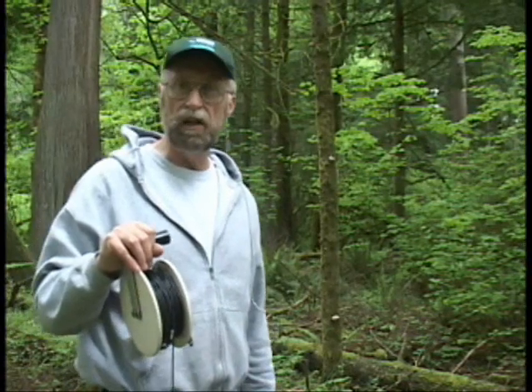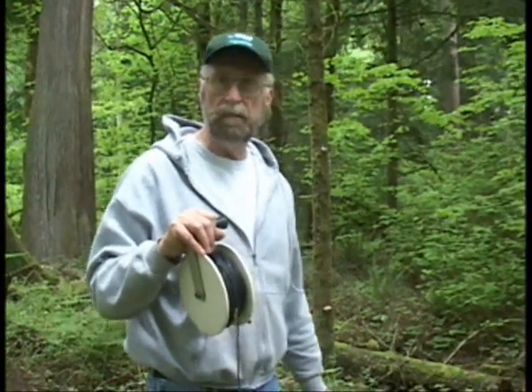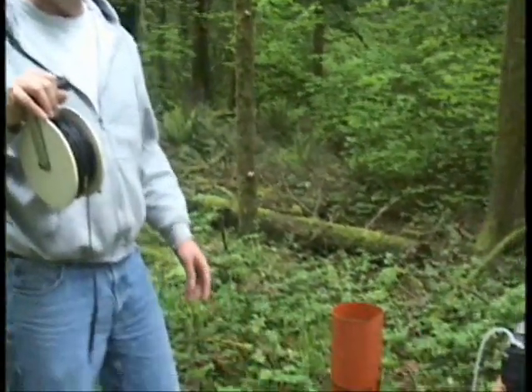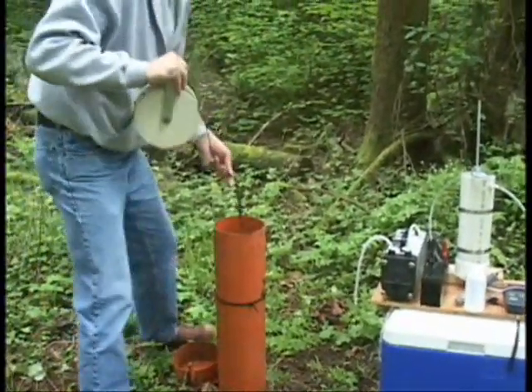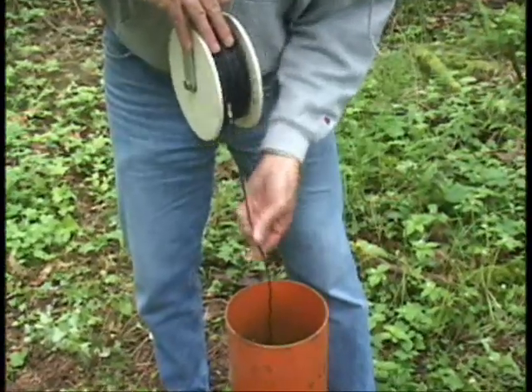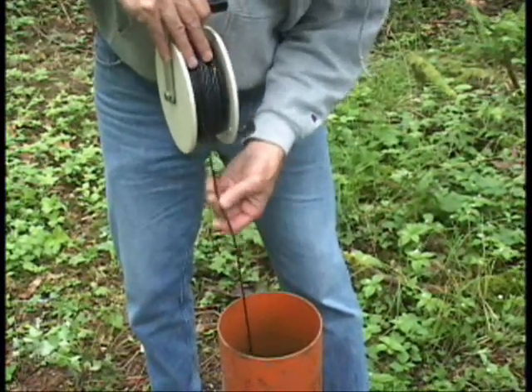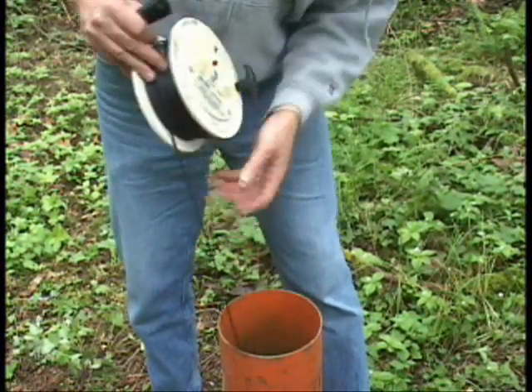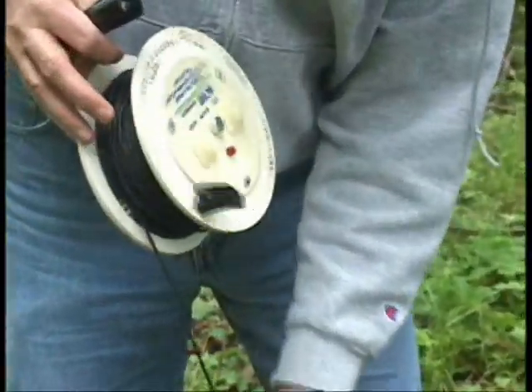We're going to take the water level, and we're going to use that information to calculate how much water we have in our well. This well is about 20 feet deep, so we're going to take our water level and determine where we want to set our sampling point. We want to measure it down to a hundredth of a foot. With this meter, the light will go on when we have contact with the water.